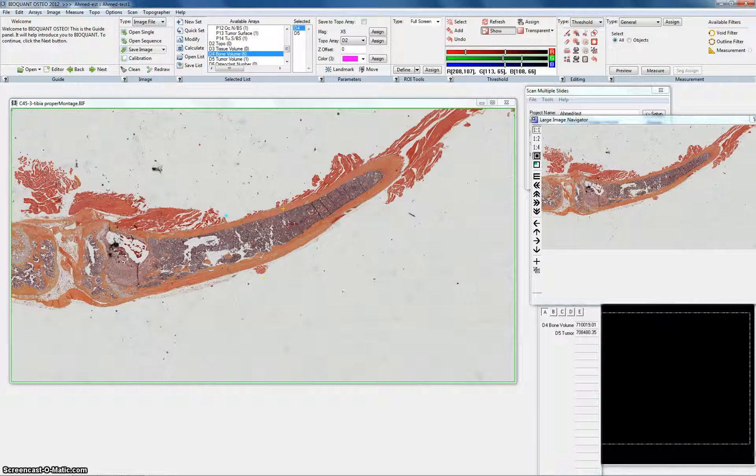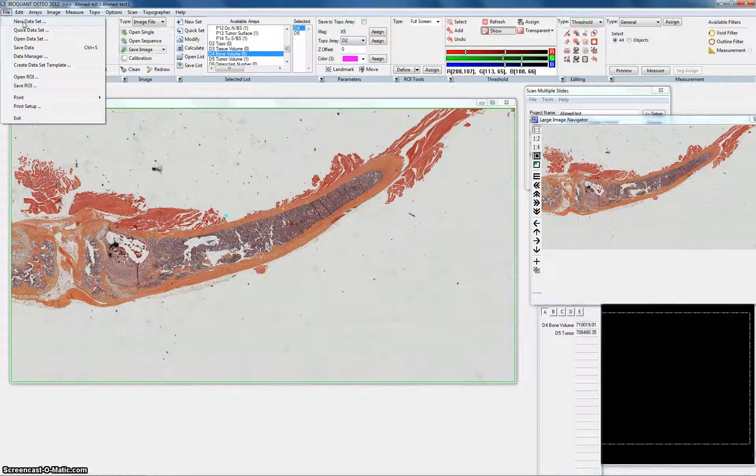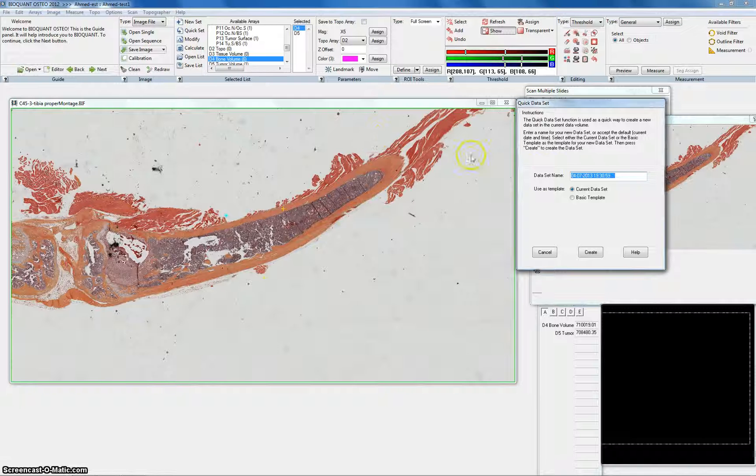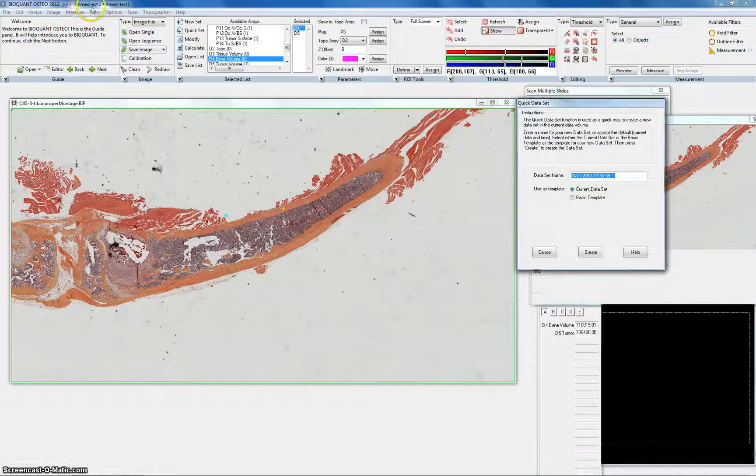Now we don't have to go through a new dataset again because since we're going to use the same parameters and it's the same project, we can go quick dataset this time. Now it's going to ask me for the name of the individual project, not the whole set. Now the whole set is Ahmed Test. The individual project is Ahmed Test 1.